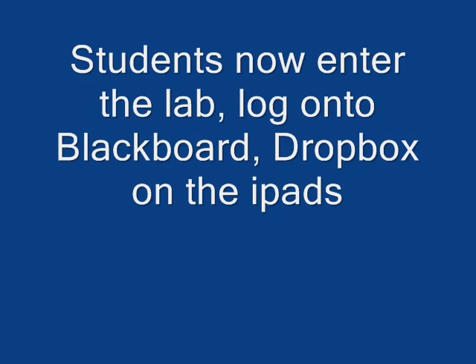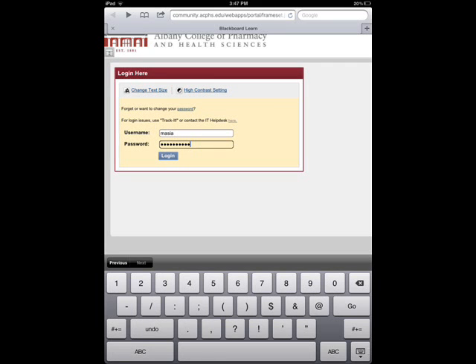The next part of this video shows you how the students use the iPads in the lab. Students enter the Microbiology Lab, which is a BSL-2 facility. They leave their coats, backpacks, books, notebooks, and laptops in the vestibule adjacent to the lab. Once they and their work surfaces are clean, they then log into Blackboard and the Document Shuttle app Dropbox.